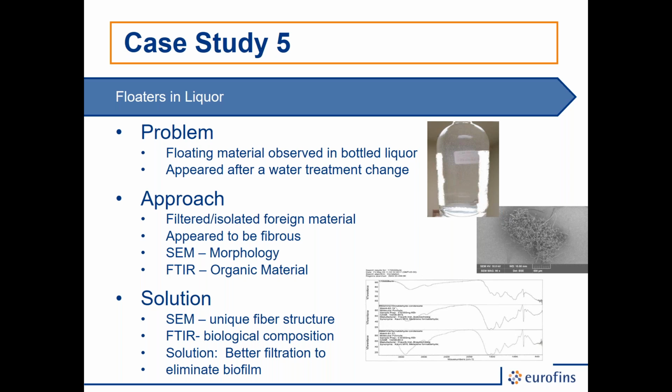The client can then sanitize their lines properly, put in a final filtering before their bottling operation. The problem went away and hasn't been an issue since. So being able to use this combination of techniques allows us to prevent getting pulled into the wrong diagnosis of the problem. And for the last few studies, I'll pass the baton back to Dave.